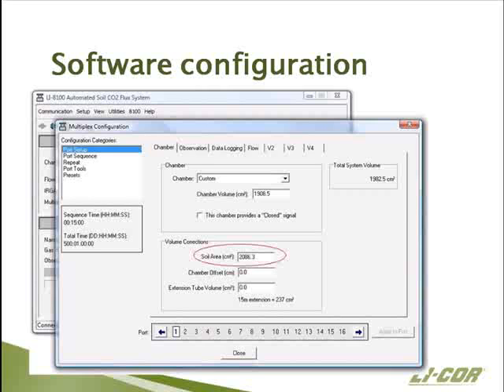But soil area is really the first space where the meaning of the field really changes. And so it could mean the same thing. You could treat this as surface area of the sample and enter it in centimeters squared. Or, for a lot of applications, you're going to want a flux on a mass basis. And so if you were to enter the mass of the sample here in decigrams, you get a flux in micromoles per kilogram per second. Whereas if you enter it in centimeters squared, the surface area of the sample, you get a flux in micromoles per meter squared per second.